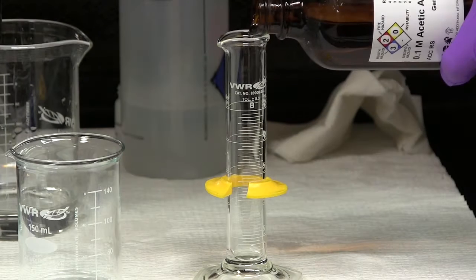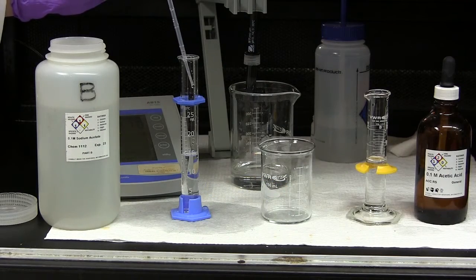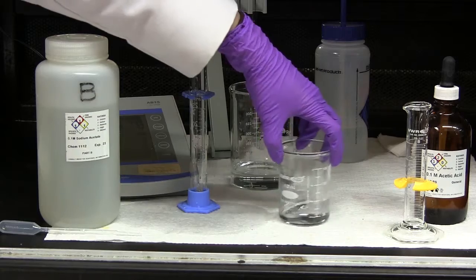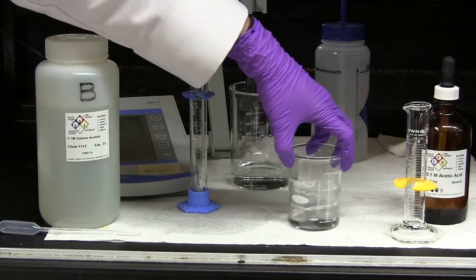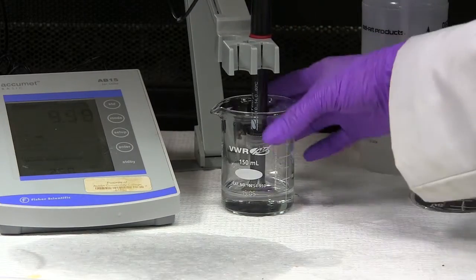Now we'll make a buffer system using acetic acid and sodium acetate. Using a graduated cylinder, measure out 15 milliliters of the acid component of the buffer. Measure out 15 milliliters of the conjugate base and add it to the buffer. Measure the pH of the mixture and calculate pKa for the acid.